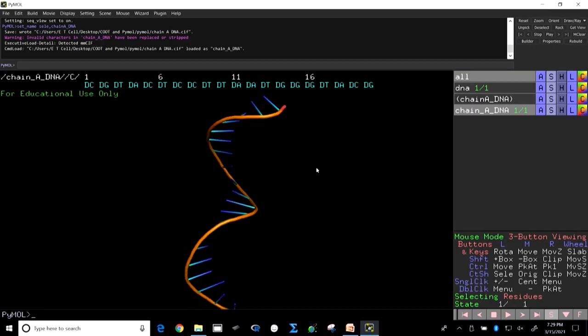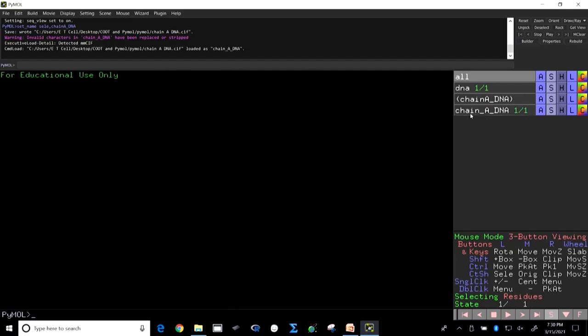So, in that way you could save a part of the 3D structure which is enabling you to do a lot of differential figure development, presentation according to the science you want to present. So, that is one thing. Then if you want to present, what type of presence you could make.